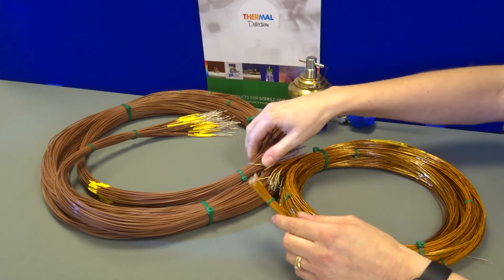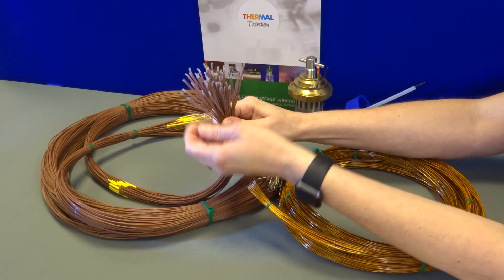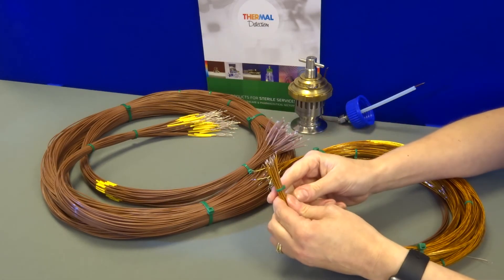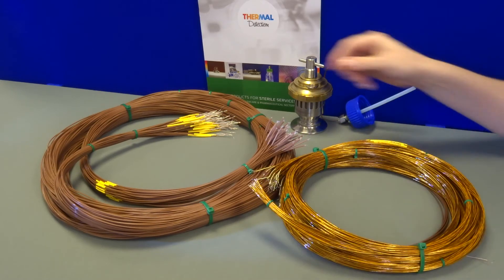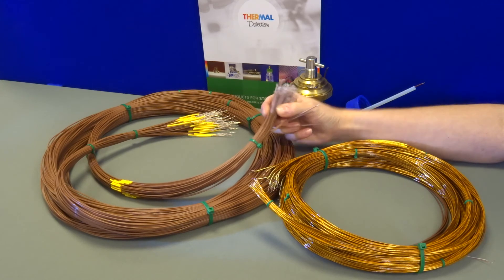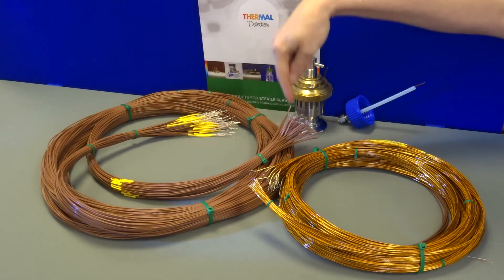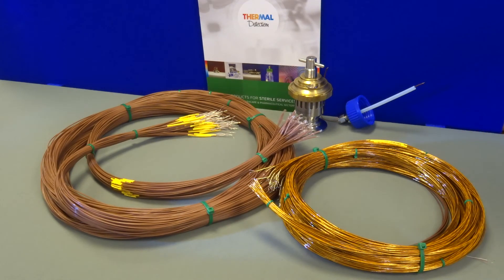Thermal Detection can offer encapsulated hot junctions or bare hot junctions. An encapsulated hot junction reduces the incidence of condensate penetrating beneath the cable and travelling through the lead to the lead end. Encapsulation also protects and reduces the rate of oxidisation of the hot junction.